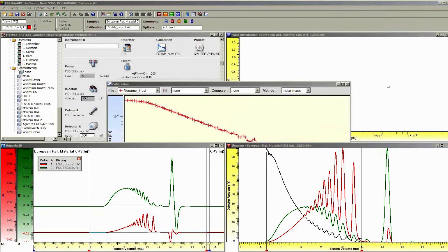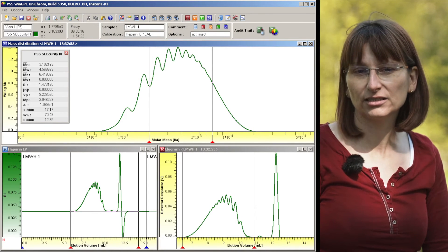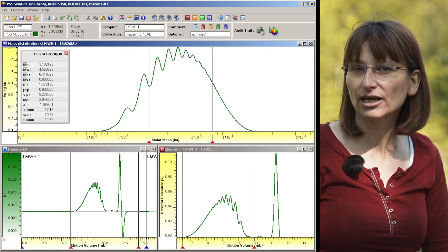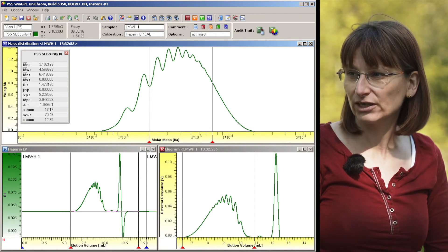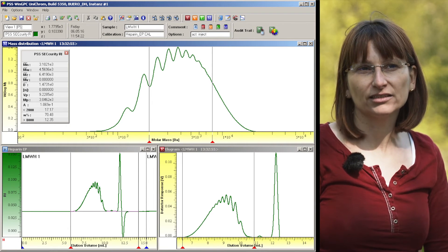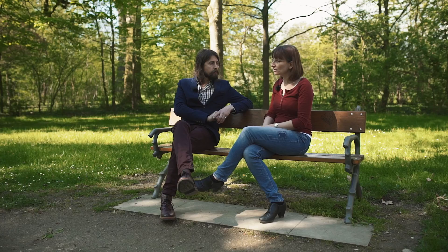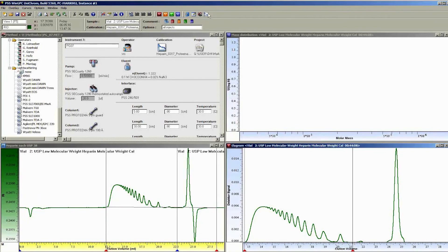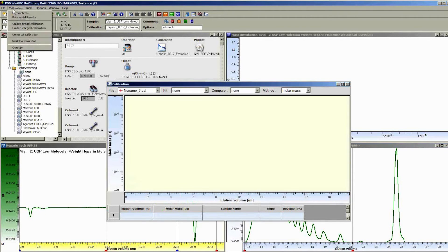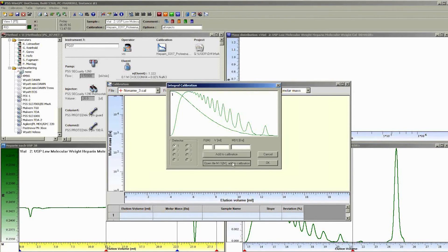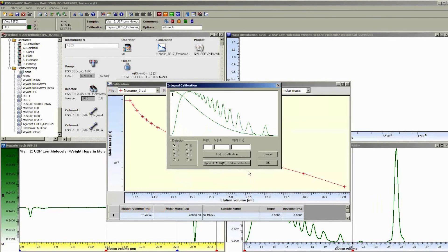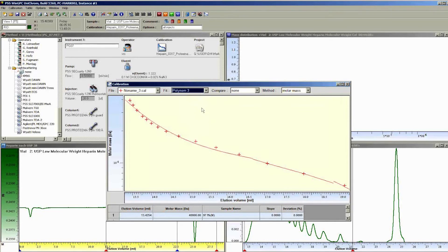From the calibration curve you obtain the molecular weight distribution, and you can see that the MW is below 8,000, showing the sample fulfills the quality control criteria. You can then set different parameters and look at fractions at certain molecular weights to confirm they meet specifications. For the USP, it's a little different: you run one heparin reference material with just the refractive index detector, use a table provided with the reference material to construct the calibration curve, and then analyze your samples to get the molecular weight distribution.